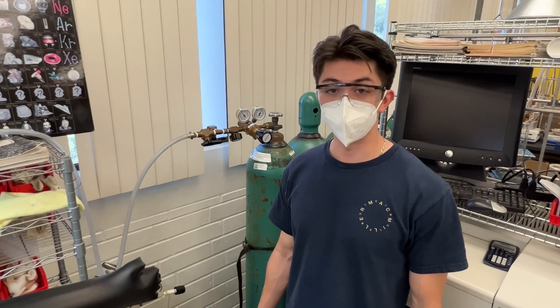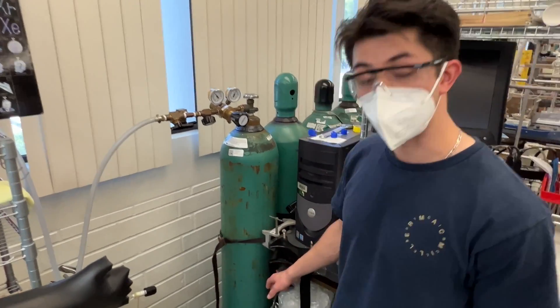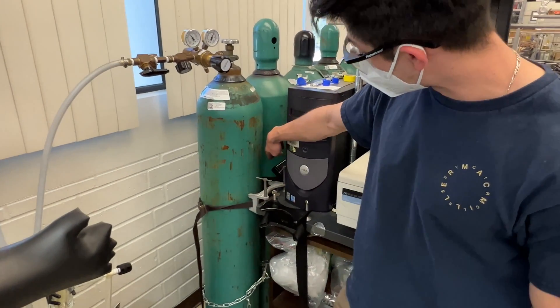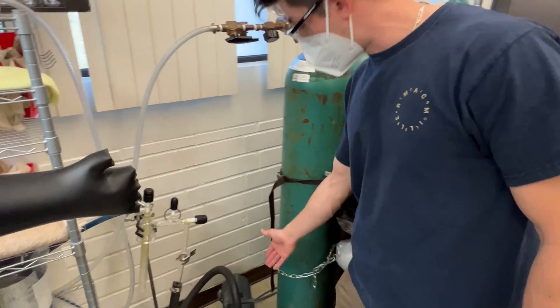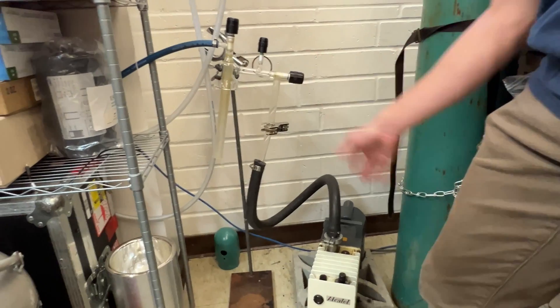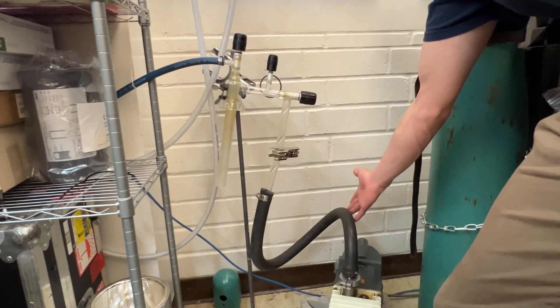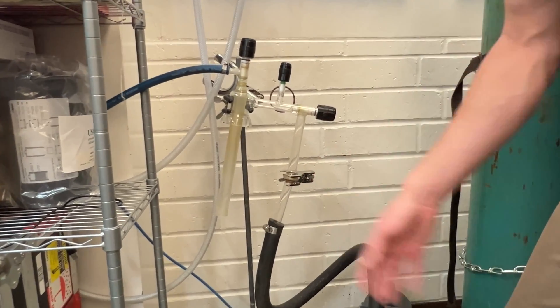There are a few things you need to familiarize yourself with before you start your cold trap. Firstly, we're going to have a fast on-off power switch, which in our case is a surge protector. Connected to our surge protector is going to be our vacuum pump, and this vacuum pump is connected to our trap setup via these rubber vacuum lines, which are connected to these glass pieces that have O-rings and their individual clamps.